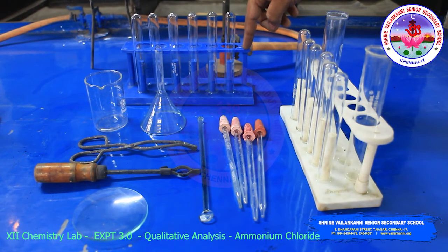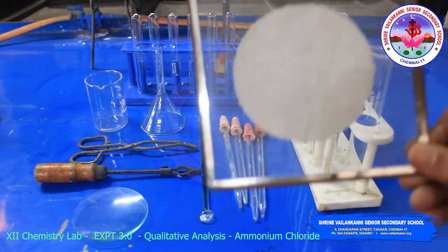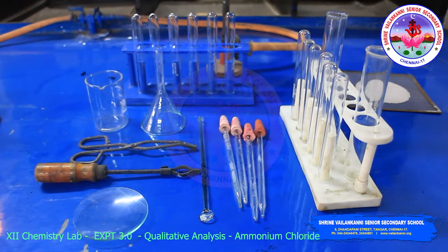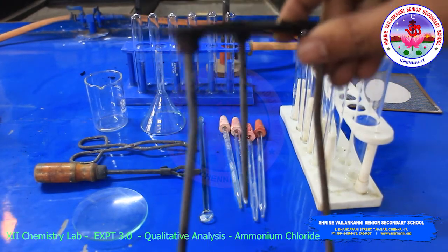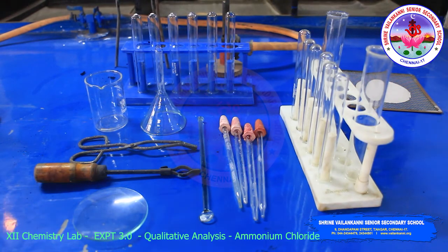This is the test tube stand, test tubes and boiling tubes, wire gauze, the tripod stand, then the Bunsen burner. Now we will do the experiment.